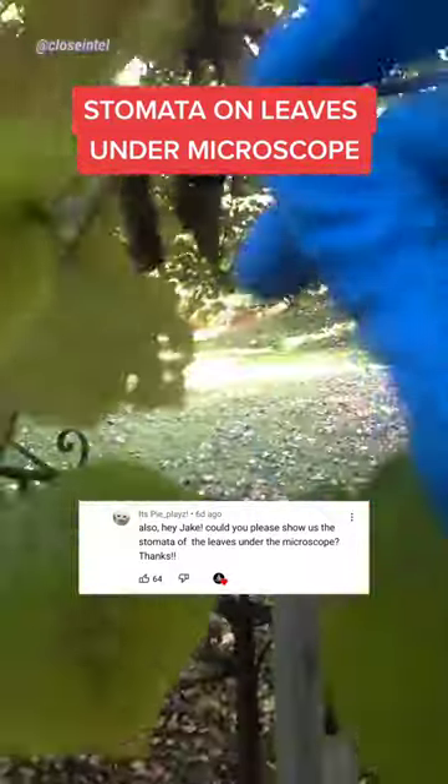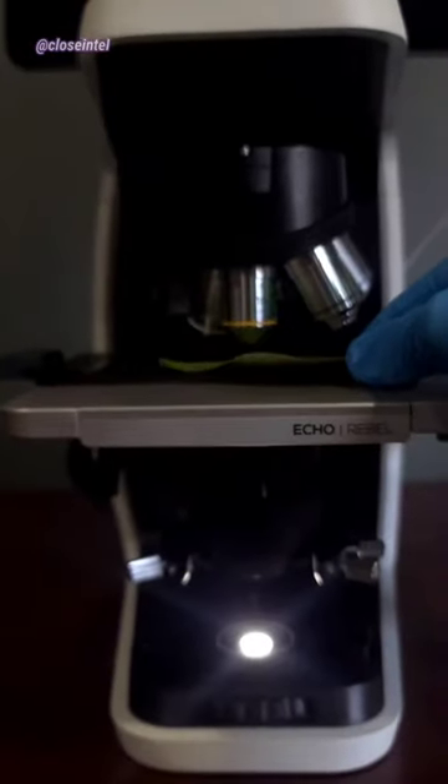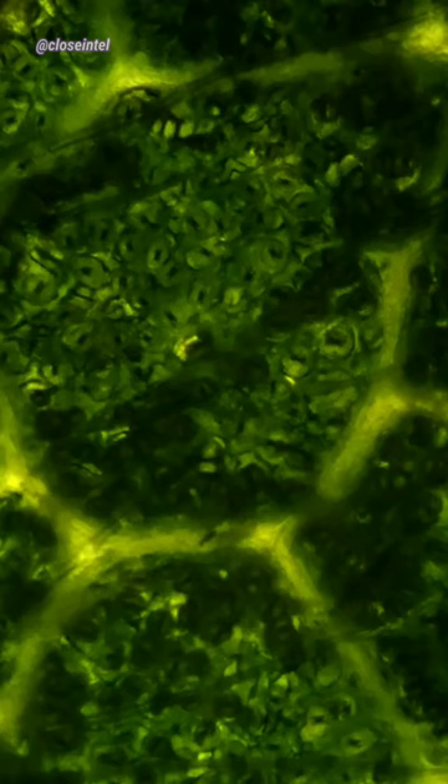I've had a lot of requests to look at the stomata under a microscope. I picked a few different leaves from trees so I could show you. Right away at 100x, you can kind of make out the stomata here. There are thousands of them on the surface, and they're a lot more prominent on the underside of the leaf.